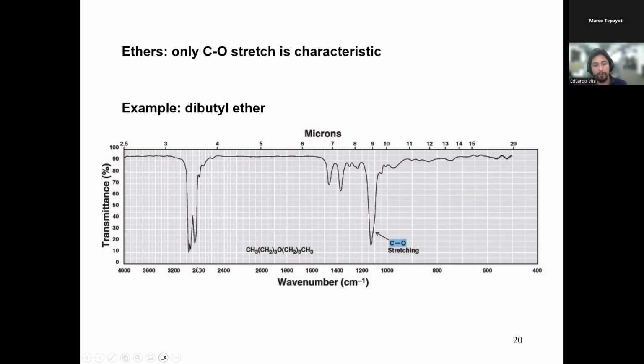And then, of course, if you look over here between 28 and 32, you will see the standard stalagmite of the carbon hydrogen sp2 sp3 stretch. So that doesn't really tell us much. If you know you have an ether, you're going to look for most likely this carbon oxygen stretch. Definitely not at 1700 because it's a single bonded carbon oxygen. So make sure you keep that in mind. The intensity matters, the wave number matters, and the location matters.